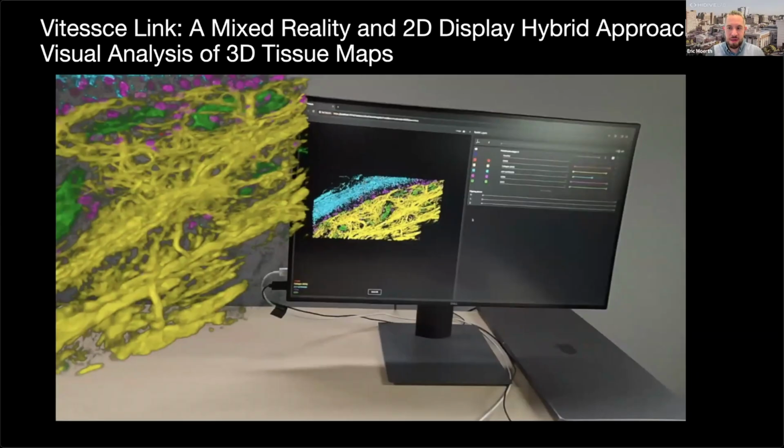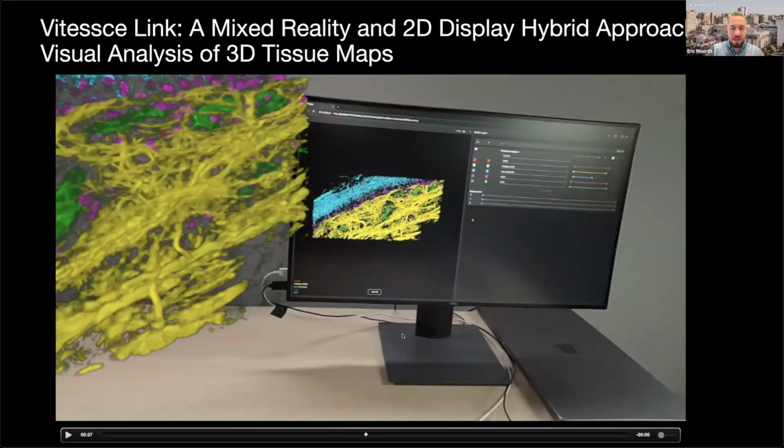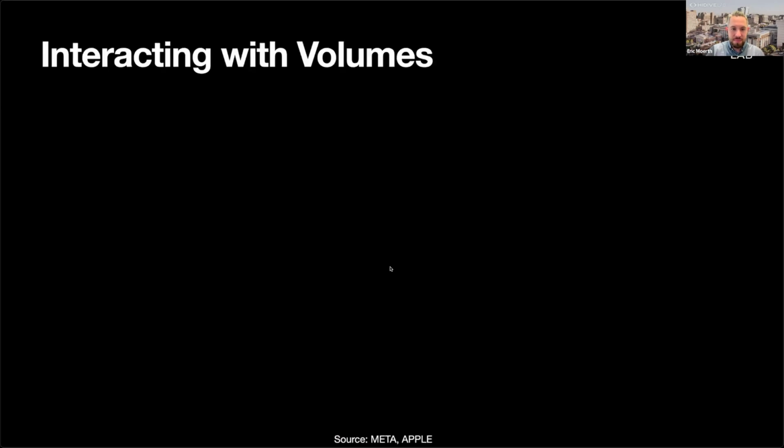And what we got as feedback from our collaborators is that now, in 3D, you can see all those intricate structures way better. Like you see this green thing that was in the middle of the data set, it is a blood vessel.